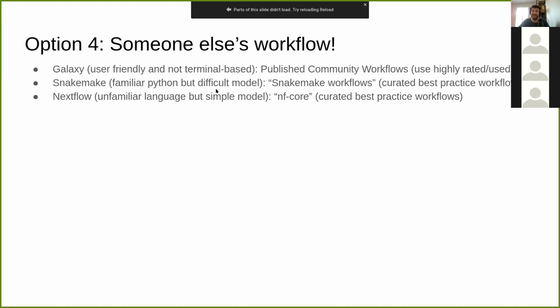There's Snakemake, which is the demo I showed, which is great if you're familiar with something like Python, but the mental model is a little bit difficult. When you're specifying all those rules and steps that you want to do, you kind of have to work backwards from the final output you want all the way back to your original reads. So I worked back from the harmonized summary all the way back to the raw reads for each sample, which is just a little bit challenging as a mental model.